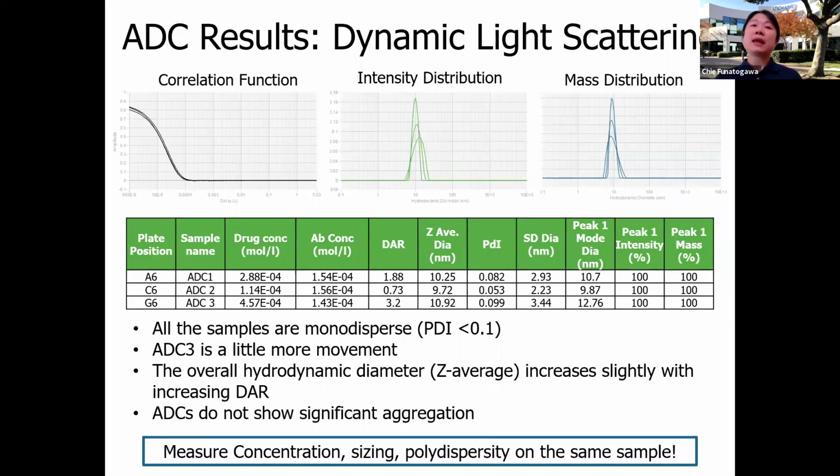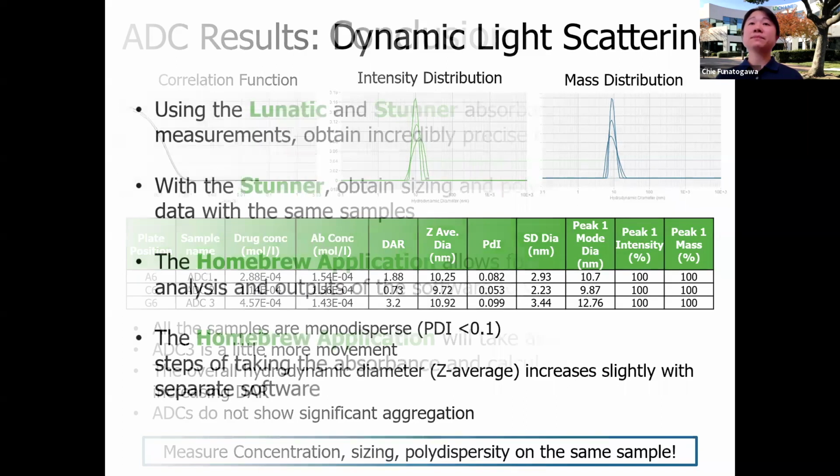So if you look at the ADCs, you can check to see if there is a clear difference in the stability. Are some samples already aggregated? In this specific example, I don't have any that aggregated specifically due to the antibody drug conjugate, but in some cases you may see some samples aggregated, and that's valuable information that you can obtain.